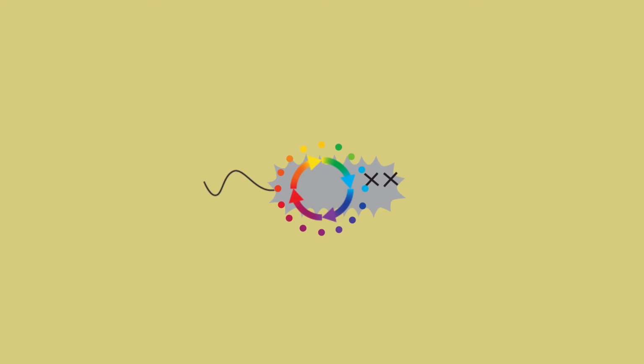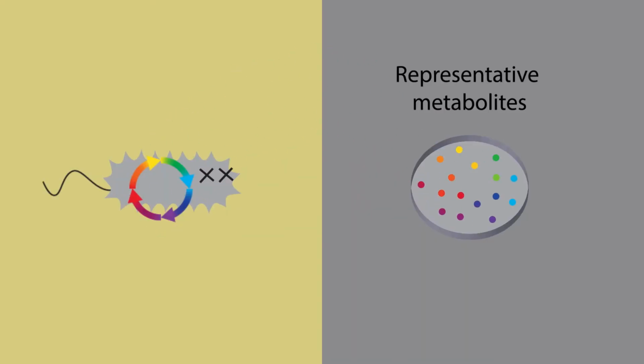Here, the colored dots in the petri dish represent the metabolites that were isolated by the extraction, and this is an ideal scenario, where our dish of extracted metabolites contains a good representation of all the metabolites that were present in our growing cells, as well as their relative abundances.